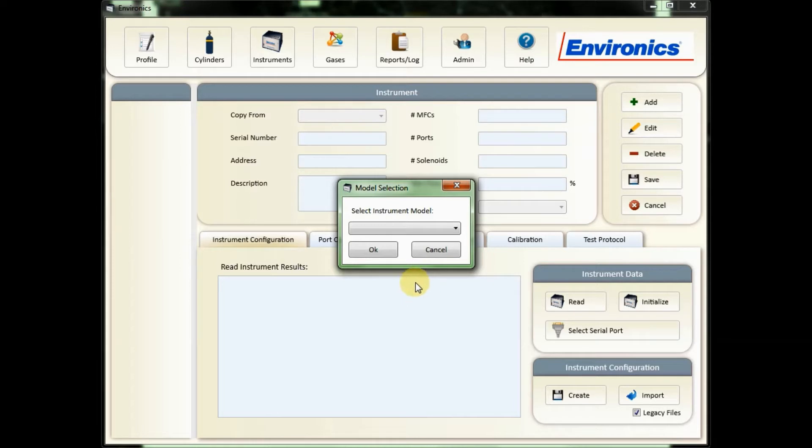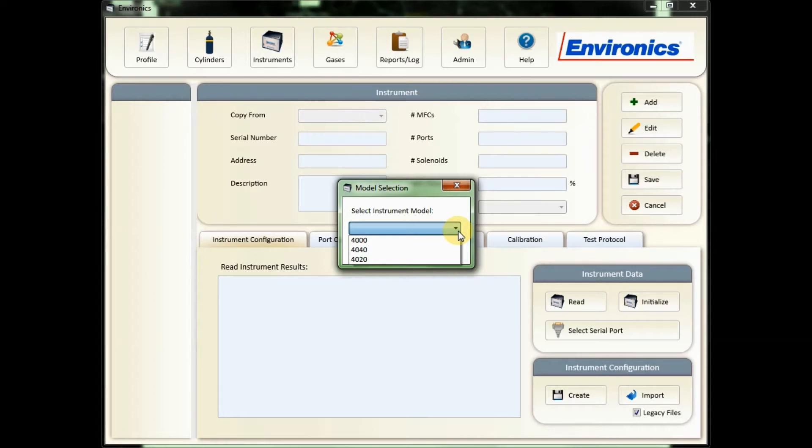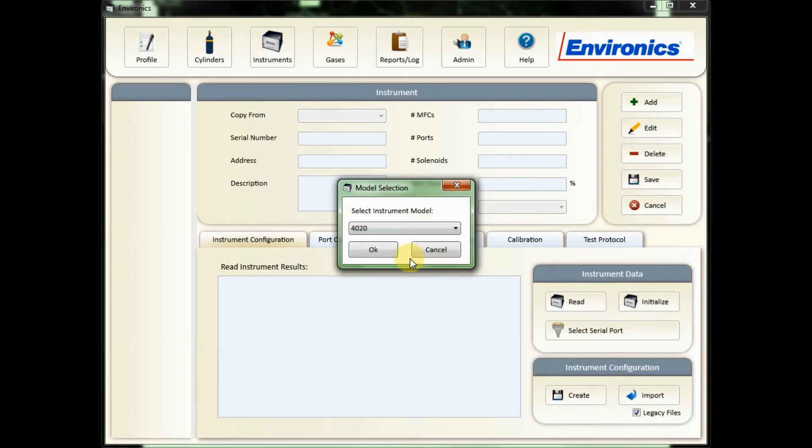A pop-up will then ask you what model type your unit is - 4020 or 4040. If you aren't sure, it would be on your original order and also on the serial number label on the back of the unit. My unit is a 4020. And then click OK.